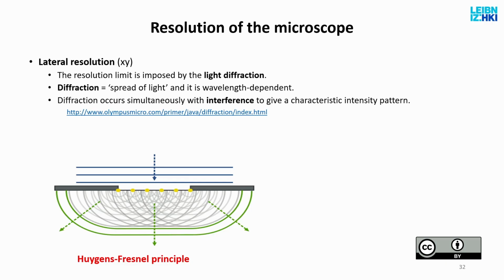If it meets an obstacle which is approximately the size of the wavelength of the light. Above that, when the light spreads through microscopic obstacles and molecules and structures, it just spreads as it has before. But when it arrives at a very small area, or it's emitted by a very small object, which is, like I said, approximately the size of the wavelength of the light, then a very interesting phenomenon occurs.